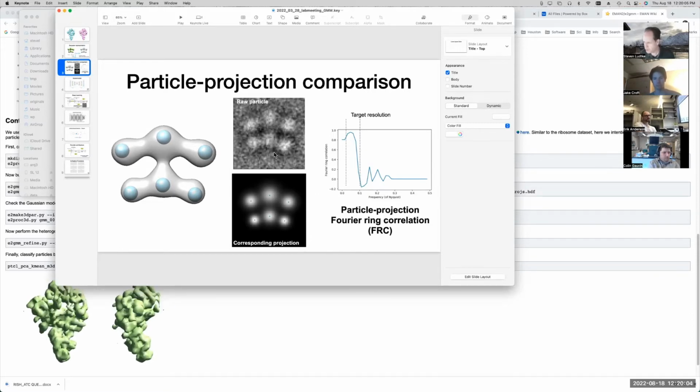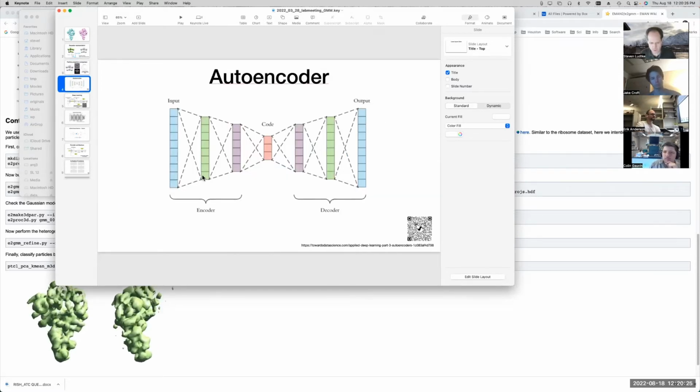But since we have incomplete data, something like a neural network allows us to say, okay, we have this information, but this information is just completely unknown, which is very hard to specify with linear algebra, things that are not known. And that allows us to solve this problem via energy minimization. So the strategy we're using in deep learning is kind of like an autoencoder. It's not actually an autoencoder.